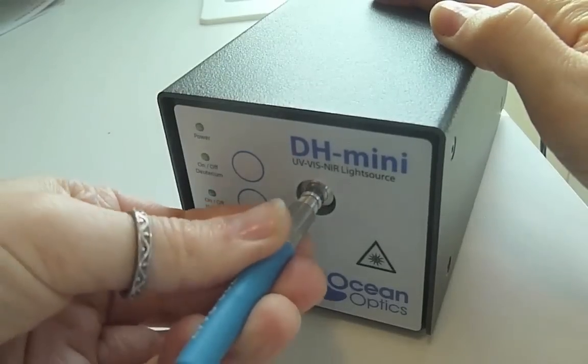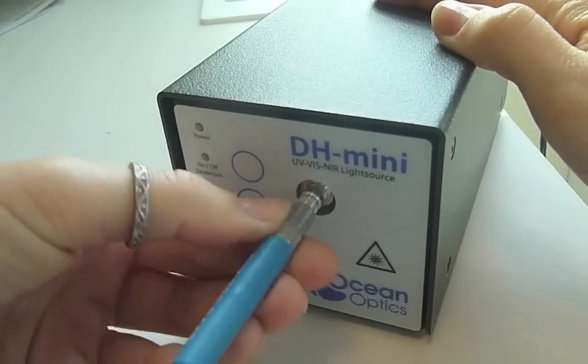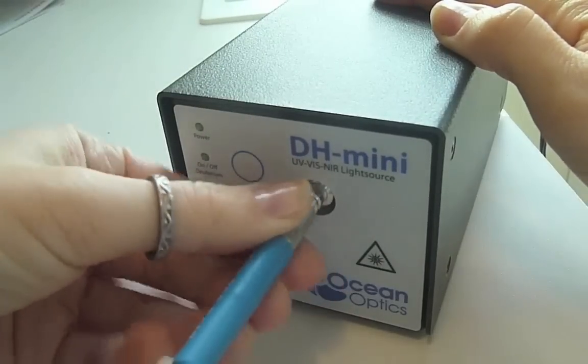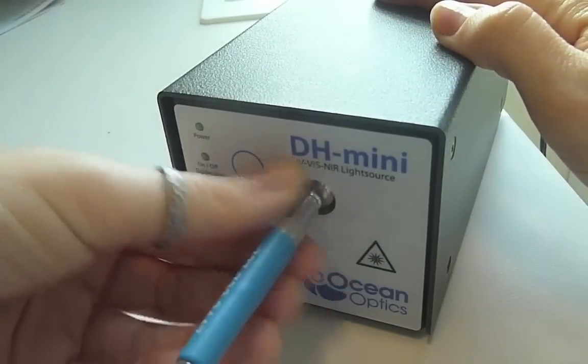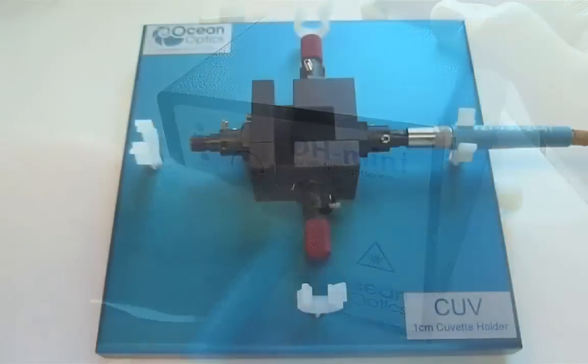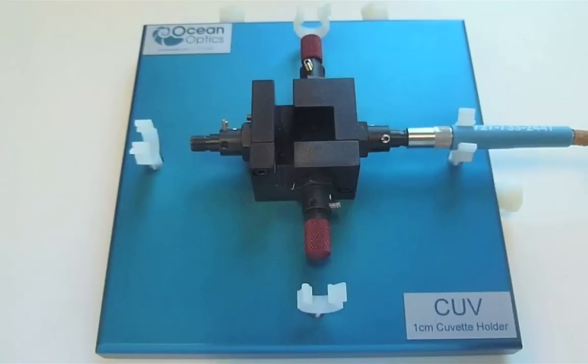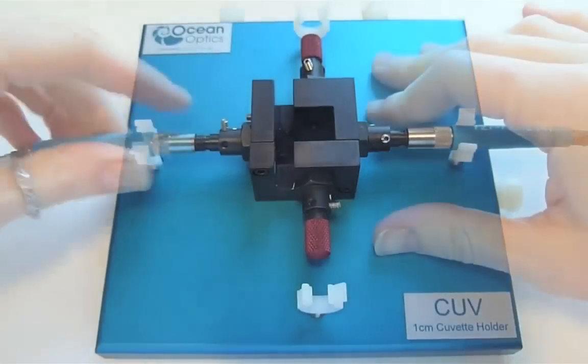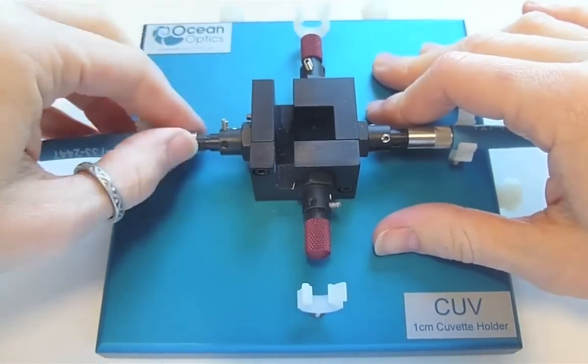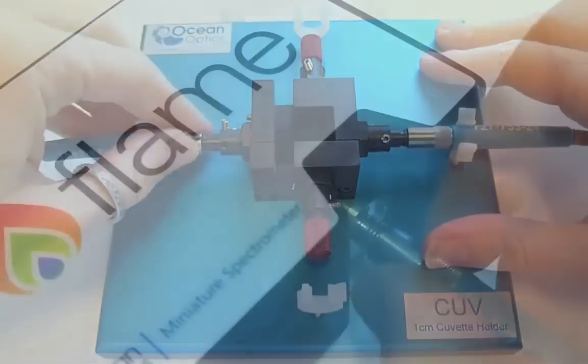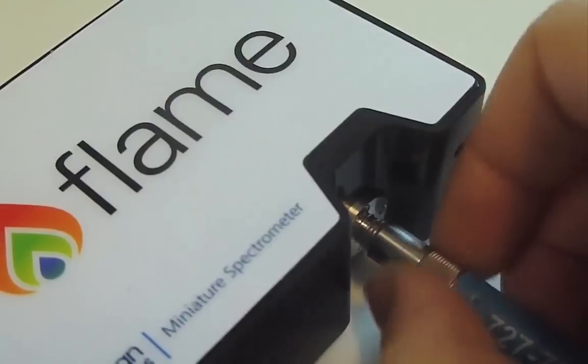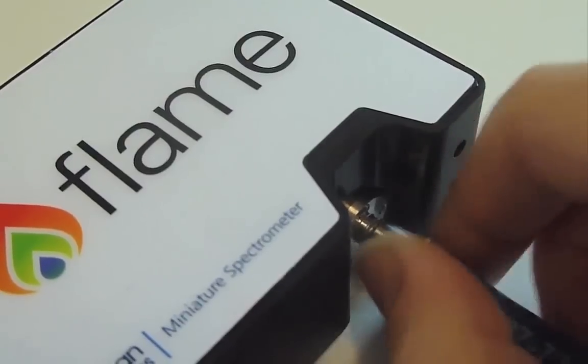To set up the instrumentation for absorbance measurements, we will simply connect one end of a patch cord to our light source and the other end to the sample holder. We will then attach the other patch cord to the sample holder in line with the first and the other end to our spectrometer.